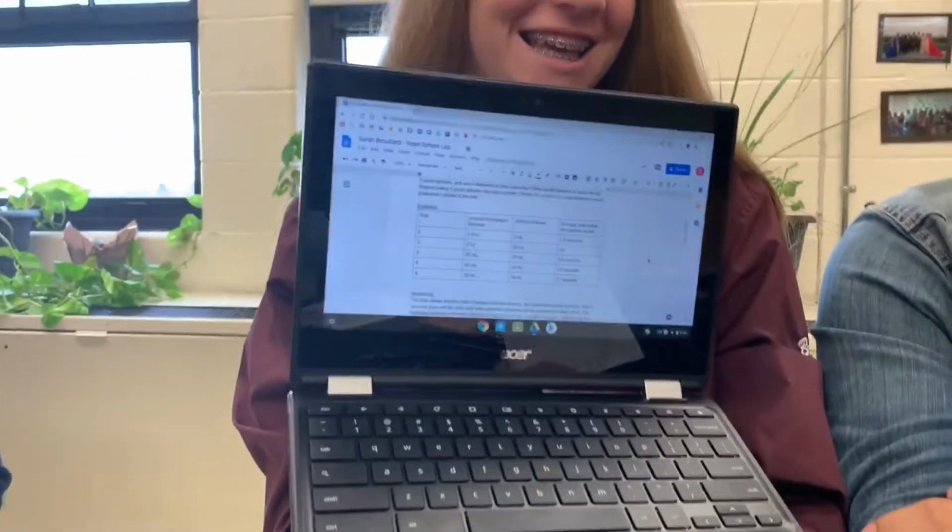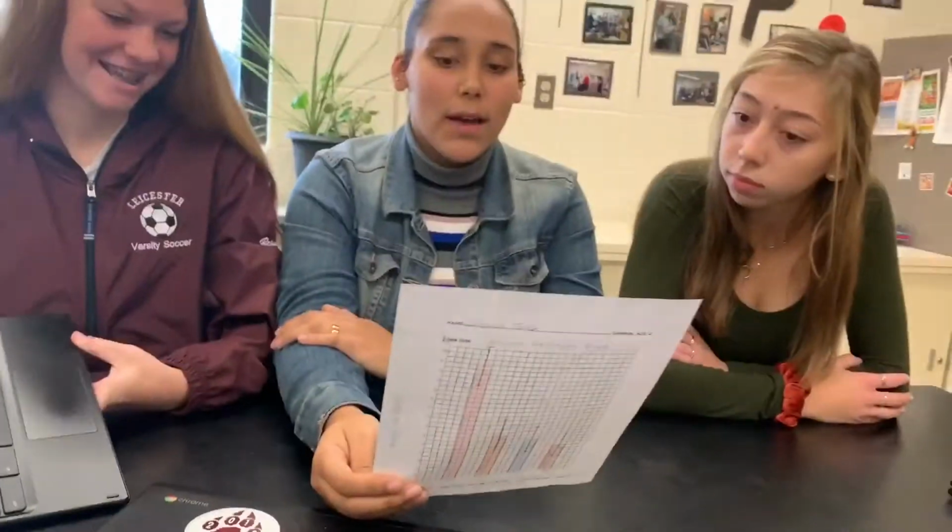Once all of your cylinders are ready, take the yeast balls and drop 5 into the first cylinder made. Time the amount it takes for the yeast spheres to rise and record the data. Once you have done this, repeat with the rest of the cylinders. Do 3 trials of this process as a way to enhance your data. For each graduated cylinder, take the average of the 3 trials and put them into a table like this. The average will help you make a box and whisker plot so you can see if your data is significant or not.